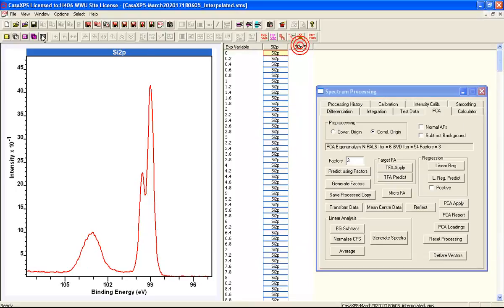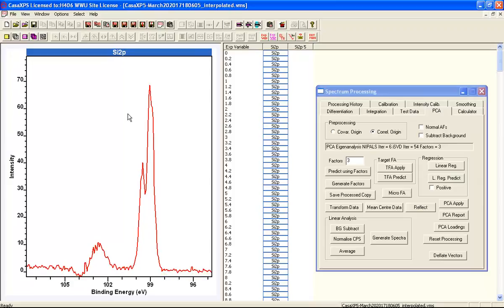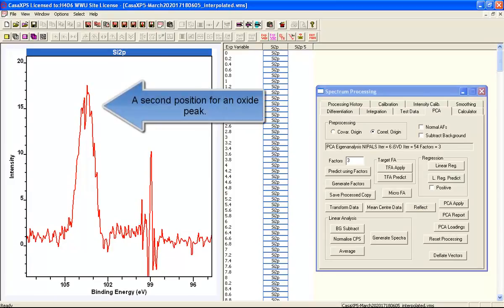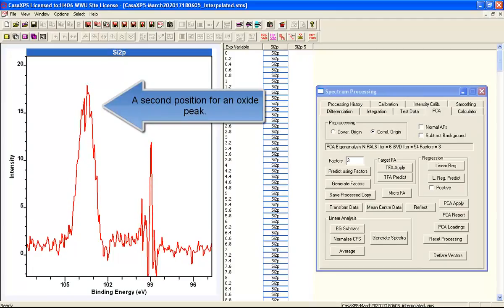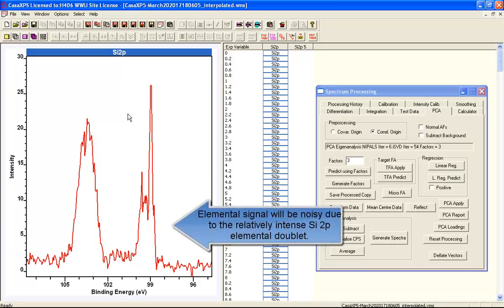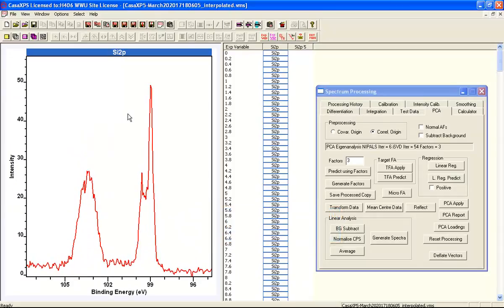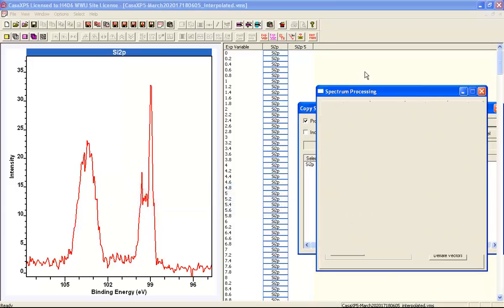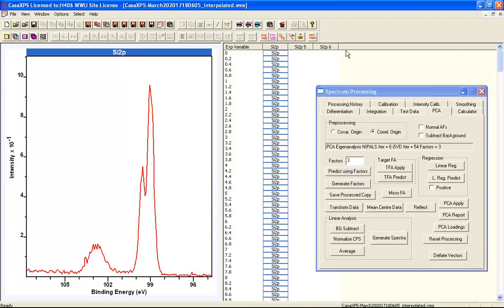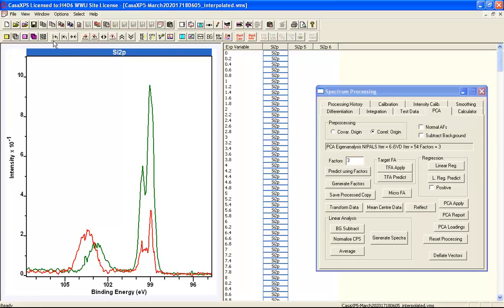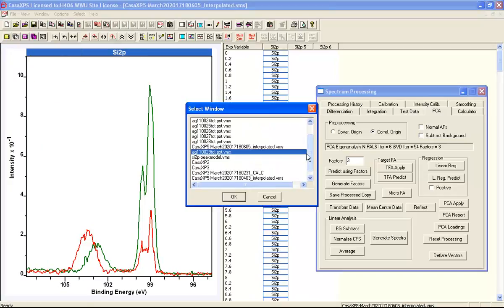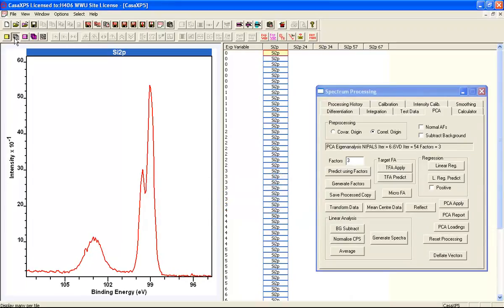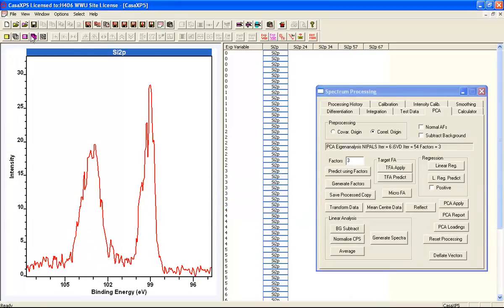We search for the complementary form of this oxide, and a second form of oxide appears. We don't necessarily have to identify this oxide all on its own — we can allow a bit of the elemental to come back in order to obtain a better shape in the oxide peak. There's a certain trial and error here, and you may have to repeat this several times. If we overlay the two oxide shapes, we can clearly see there's an oxide with a significant shift, suggesting a different chemical state. The elemental silicon peak has noise within it, again characteristic of Poisson statistics when you have two intense peaks.